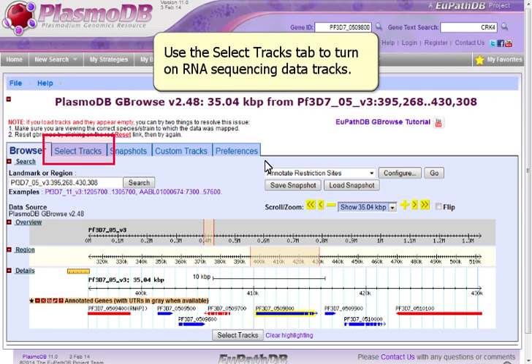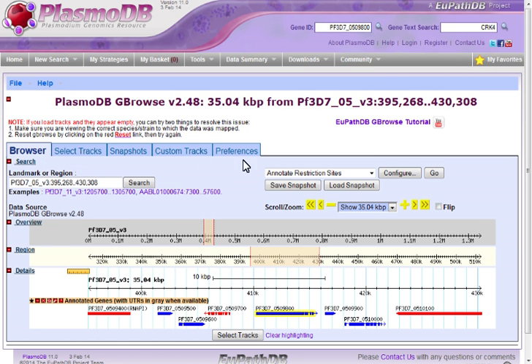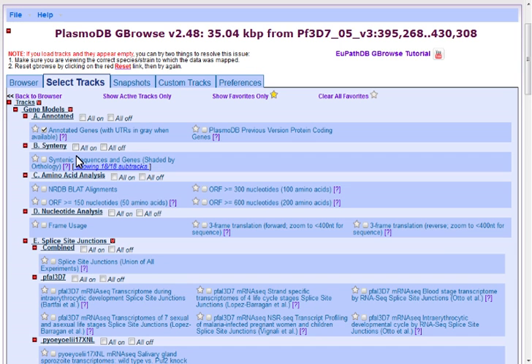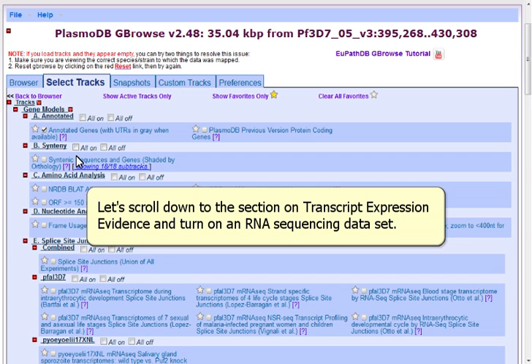Use the Select Tracks tab to turn on RNA sequencing data tracks. Let's scroll down to the section on Transcript Expression Evidence and turn on an RNA sequencing data set.